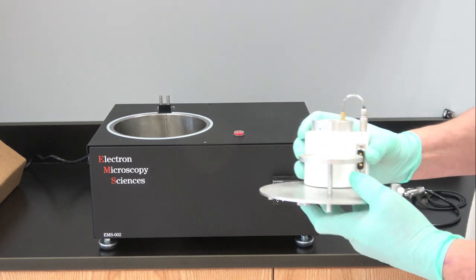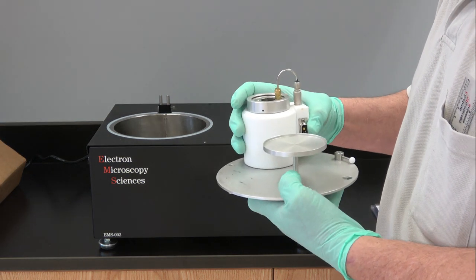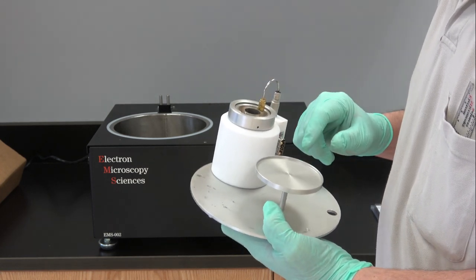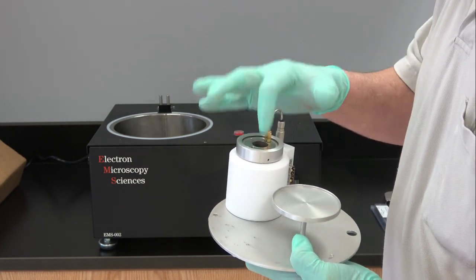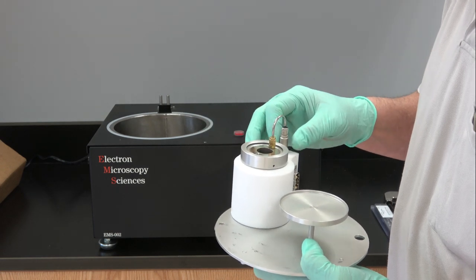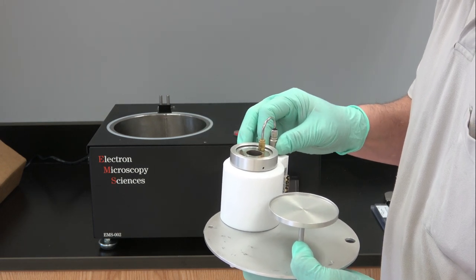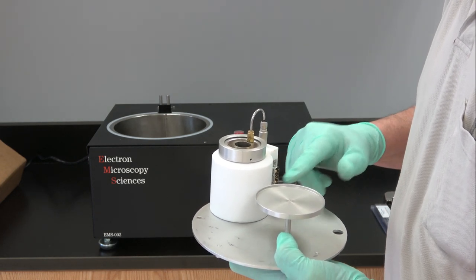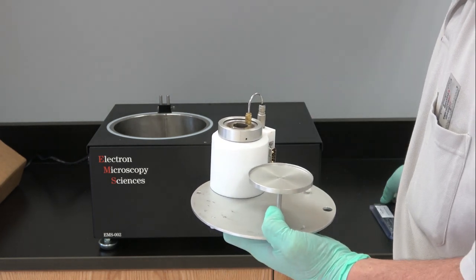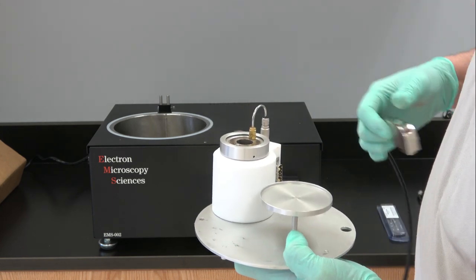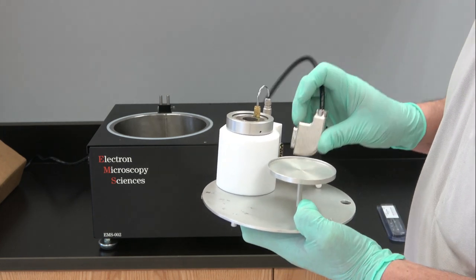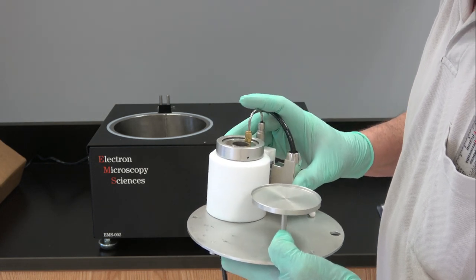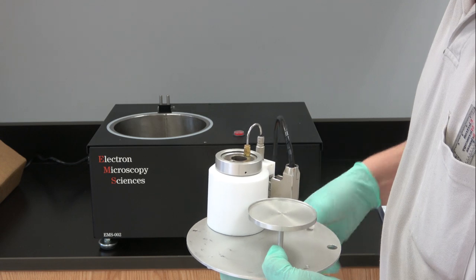First thing you would do is remove the condensation chamber insert which has three or four main parts to it. It has the condensation chamber. This is the electrical connection which for the most part you leave connected all the time. Another electrical connection which supplies power and your temperature sensor to the rest of the unit.